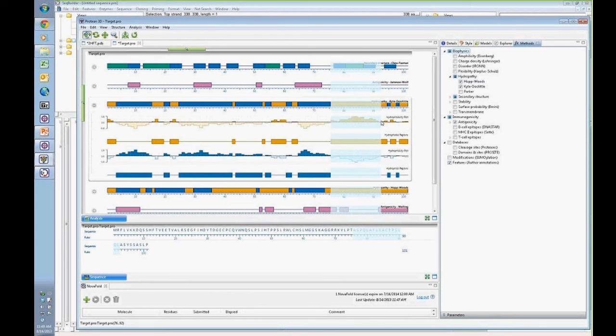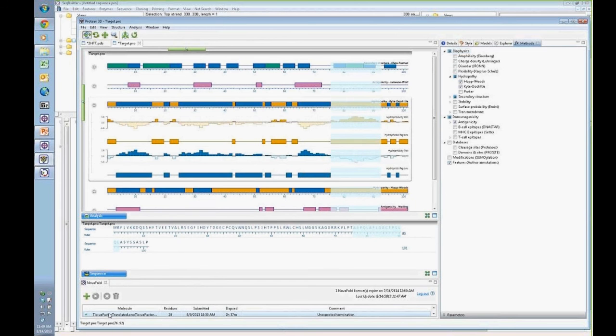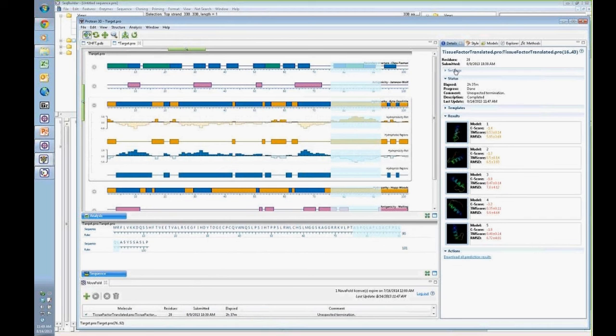So if I simply highlight this little portion here in the hydrophobicity plot, in this specific case, there's a scale of -4.5 to +4.5. This specific part of the amino acid sequence or the target is hydrophobic. So this may be something that's in the transmembrane or the intracellular space. But as you highlight these selections, I can utilize our NovaFold application to create a visualization. To verify that, I can highlight that selection, select Structure, Predict Structures, and create a prediction for the selected region. Right now, 400 amino acids would be the largest. We're expanding on that in the near future. You can also align specific structures together.